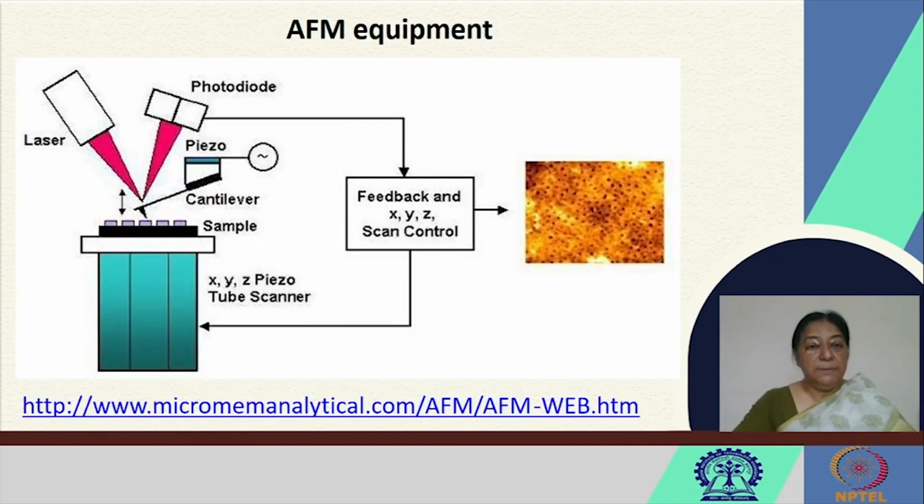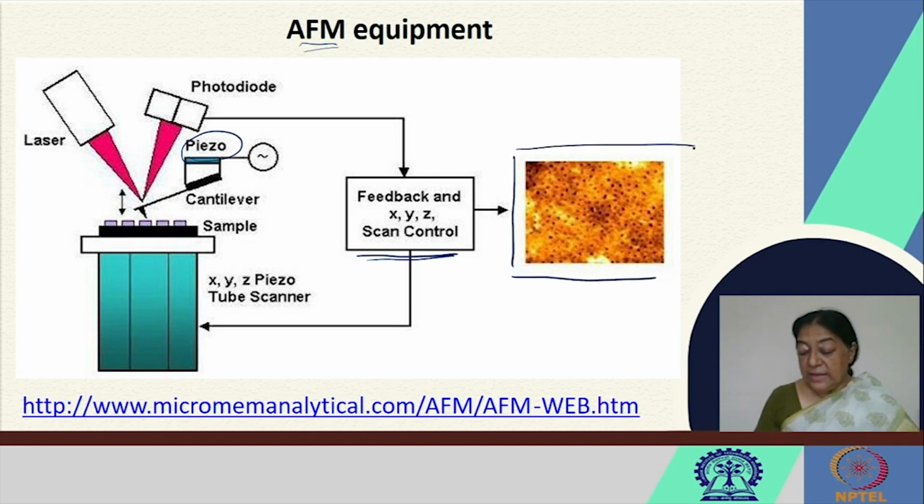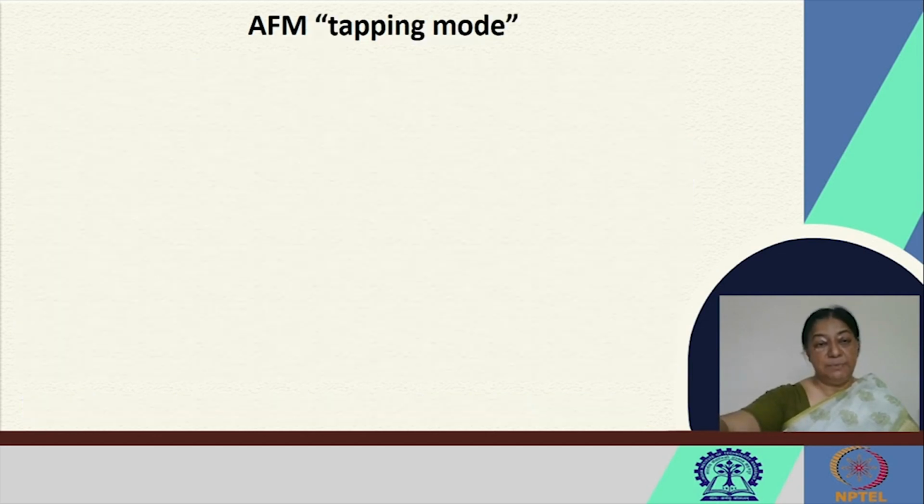In typical AFM equipment, we have a laser beam and a cantilever, and this is the piezoelectric crystal. As we scan across the sample, we have the feedback of the XYZ controls here that gives us a scanned image of our specific sample.